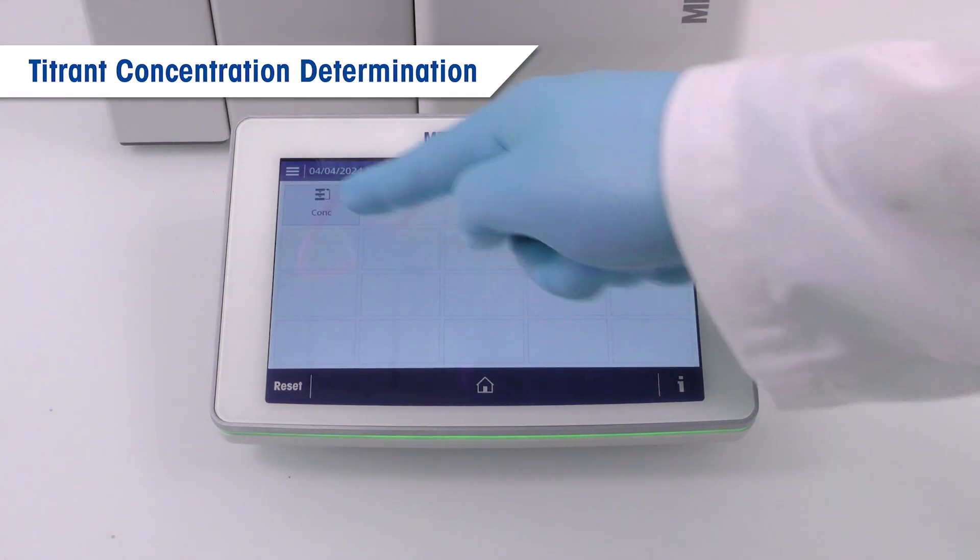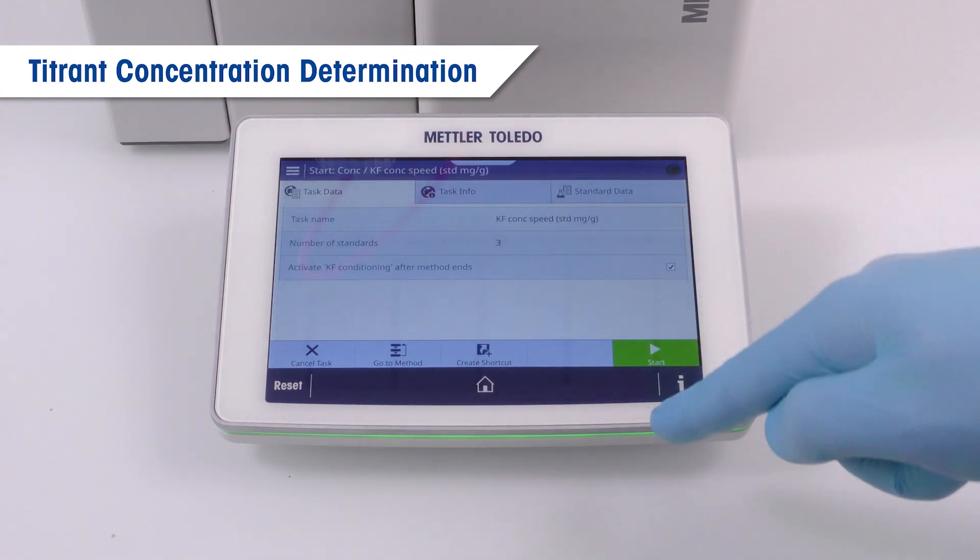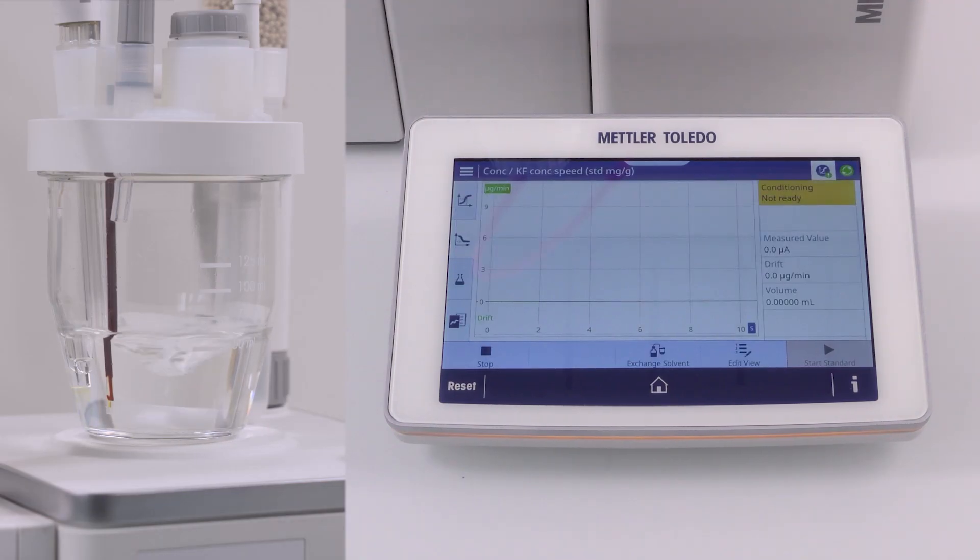We start with the actual concentration determination. Enter the number of certified standards that you want to measure and start a task via the shortcut. After the cell is conditioned and the start button turns green, the system is ready to receive samples.